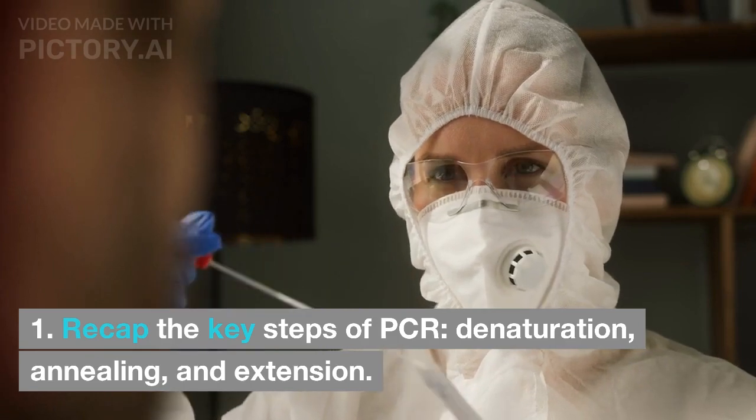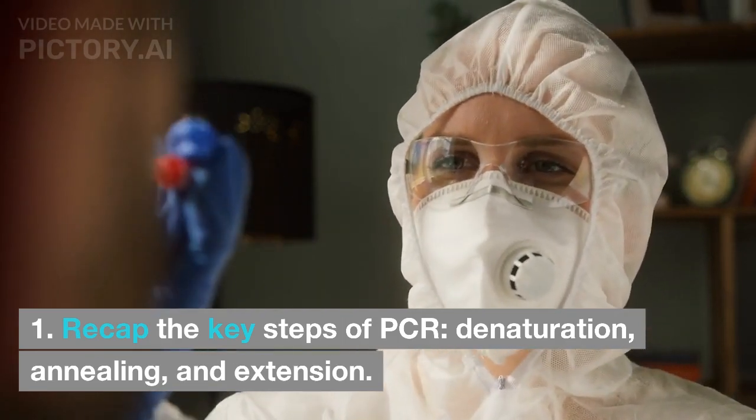Recap the key steps of PCR: denaturation, annealing, and extension.